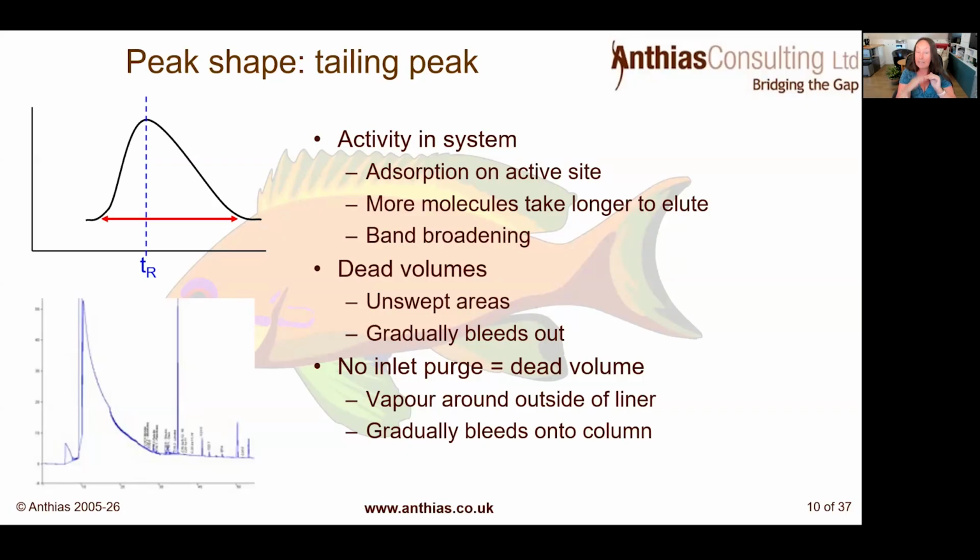Now, it's a tailing solvent peak. Those peaks that you can see on there will also be tailing a little bit, but remember, they're much lower in concentration. So what you really see is a solvent peak tailing. And of course, that's interfering with the separation of those early eluting peaks. And that's all just basically due to a blocked split line. So that's again a very good example of a dead volume in our system. So whether you haven't opened a split exit in your splitless injections or it's got blocked, you can get the same effect.